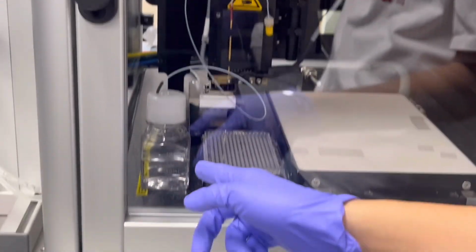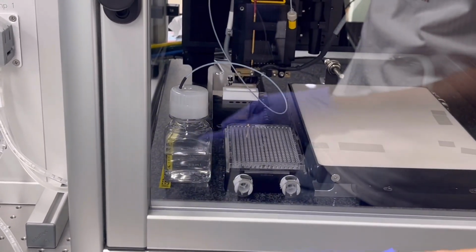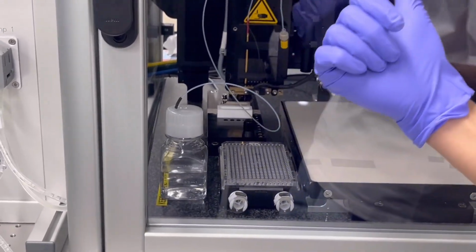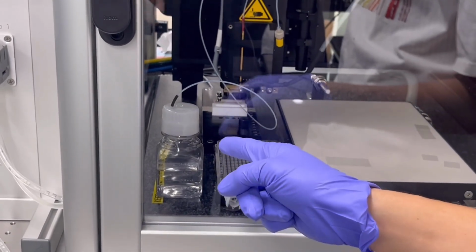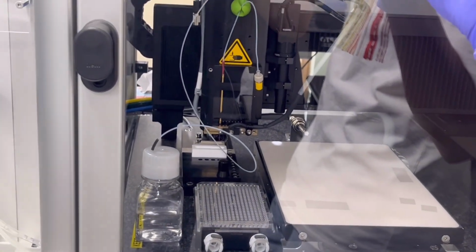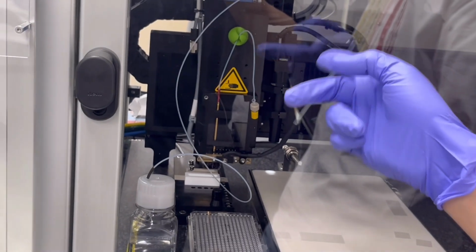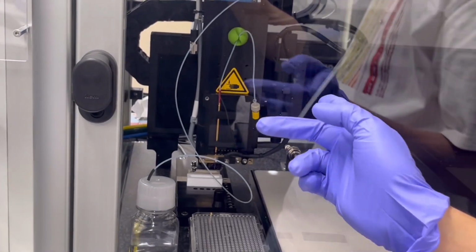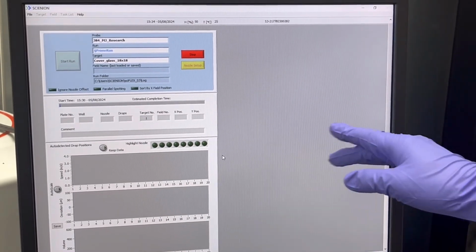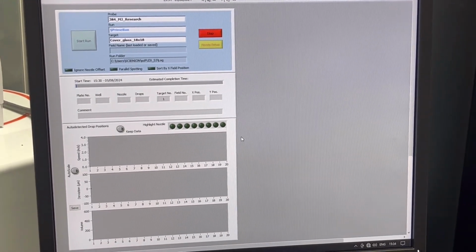And this one, flush bottle. Flush bottle is meant for washing. And bottle is the bottle, right? Remember? Again? Flush bottle. Manifold. And PDC or nozzle. We have to remember it, because when we are working with the software, they will show the name, and we have to understand.